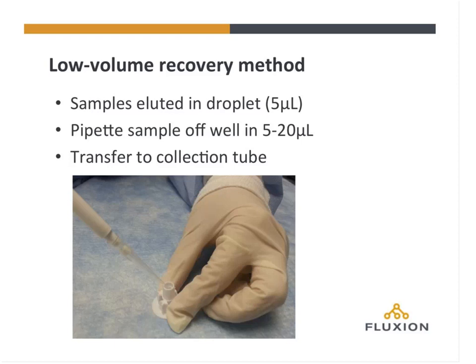And that's typically how we handle our samples internally, because it's not always convenient to take each sample one at a time into a PCR reaction or sequencing. So we typically bank our samples for many months at a time before we go back and process them. And that's a very stable and reliable process.